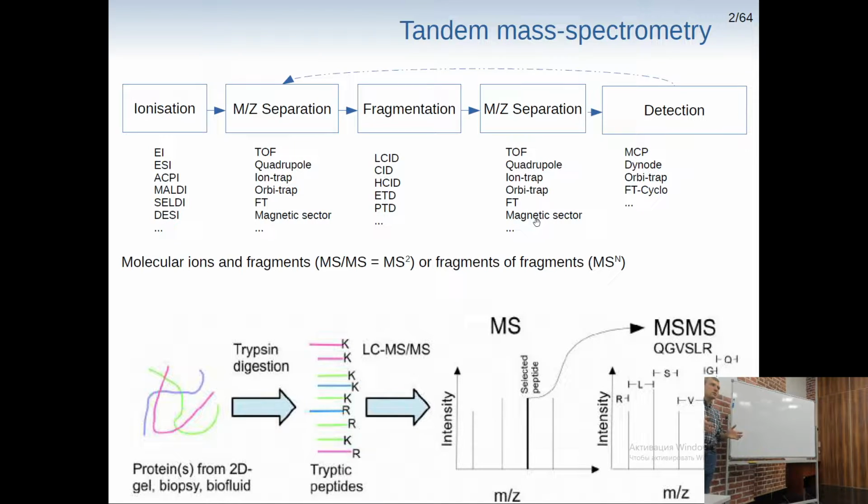In most cases, it is impossible to do because not all of those fragments will have a charge on them, and some of them will be missing. For instance, if you have a proline, there will be no good fragmentation of the peptide bond between proline and another amino acid. Why is that so? What's important about proline? It is an imino acid, not an amino acid.